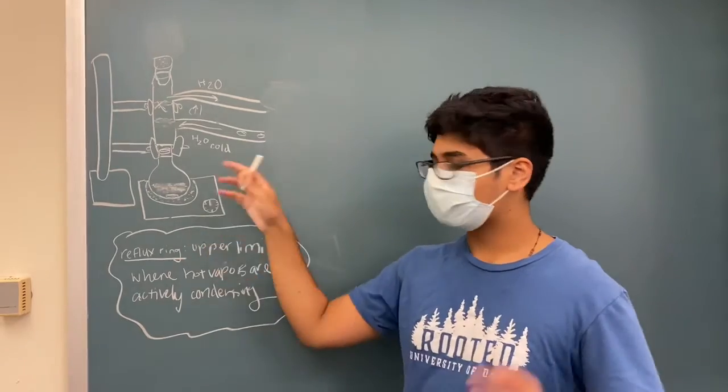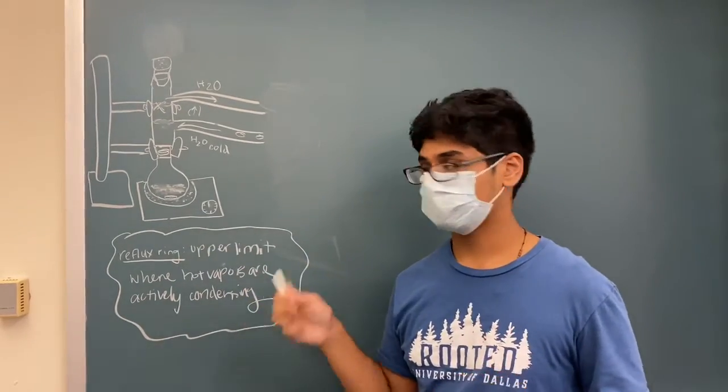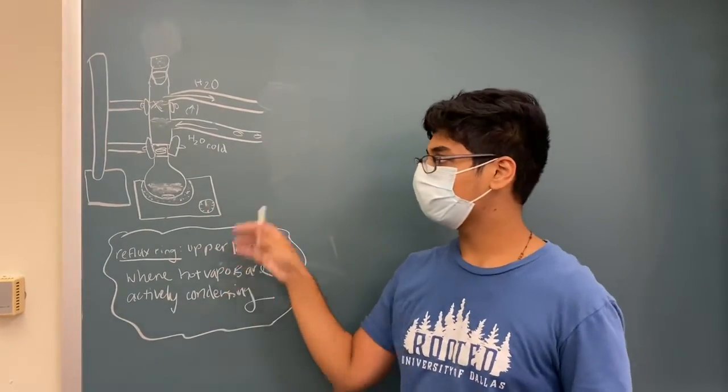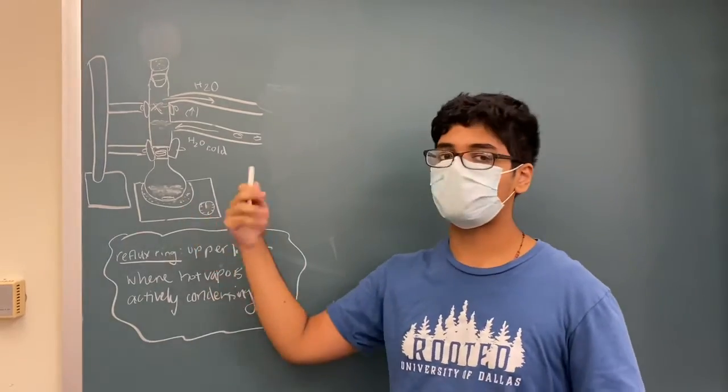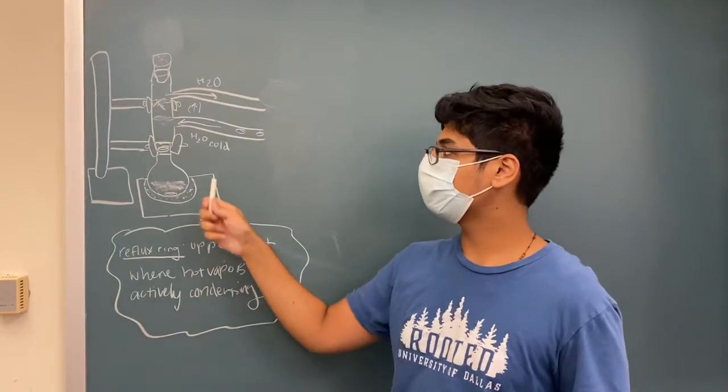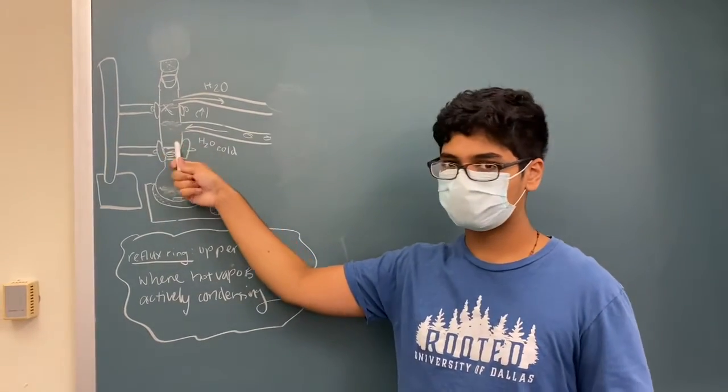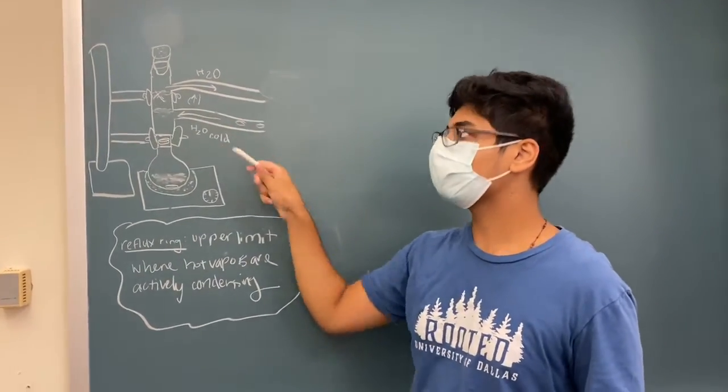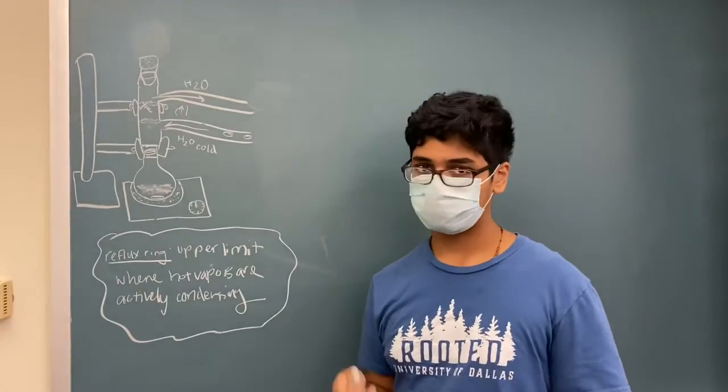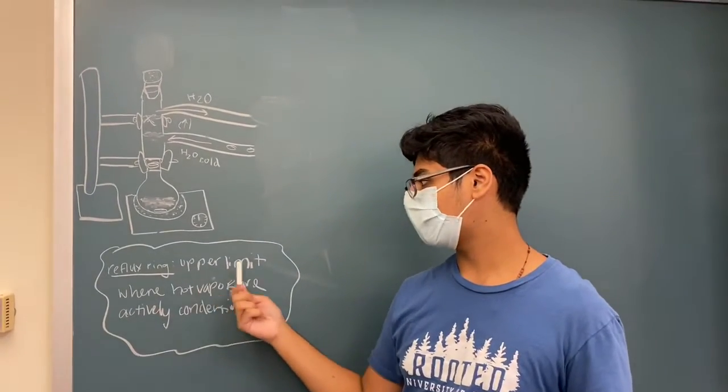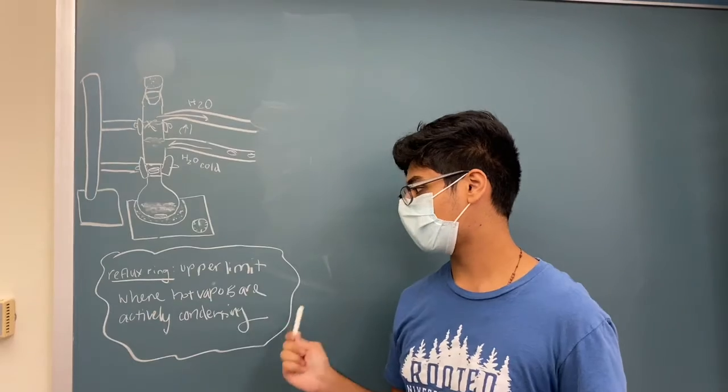Then once all the apparatus and everything is set up you start turning the heat and you should see that the solution is starting to boil. As the solution boils you should observe a small reflux ring along the lower one-third region of the vertical condenser column. Basically a reflux ring is the upper limit where hot vapors are actively condensing.